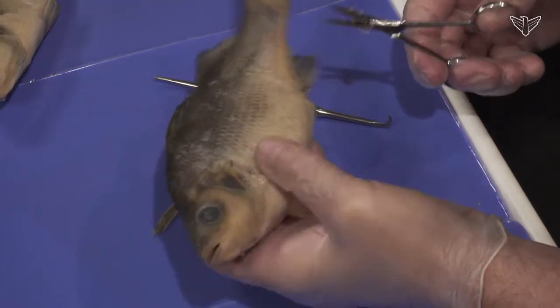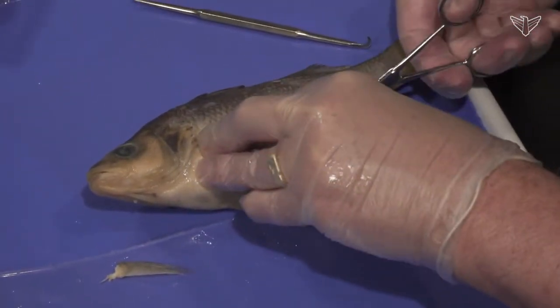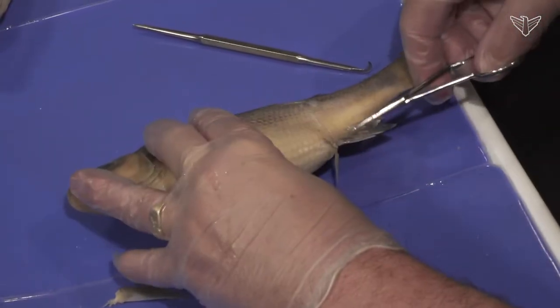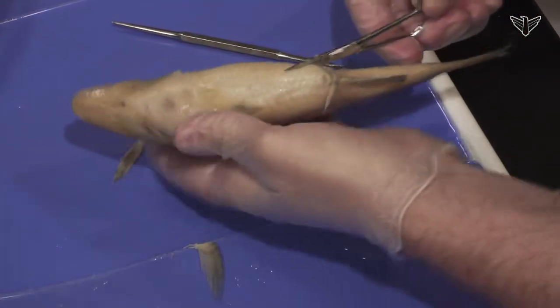Cut up to at least the lateral line probably. You get up into the muscle group so it gets a little harder. I'm going to extend this one forward a little bit to make it easier to cut.